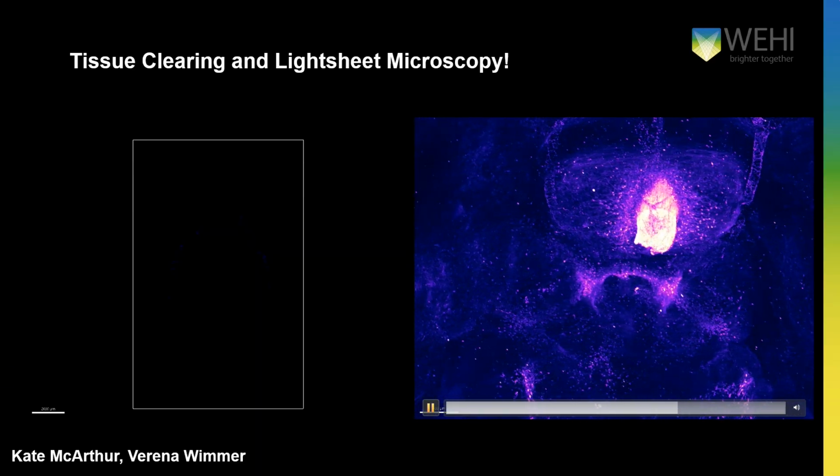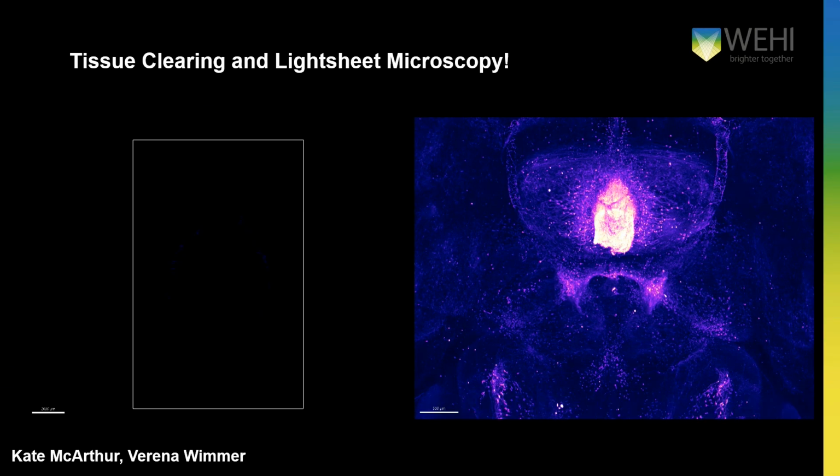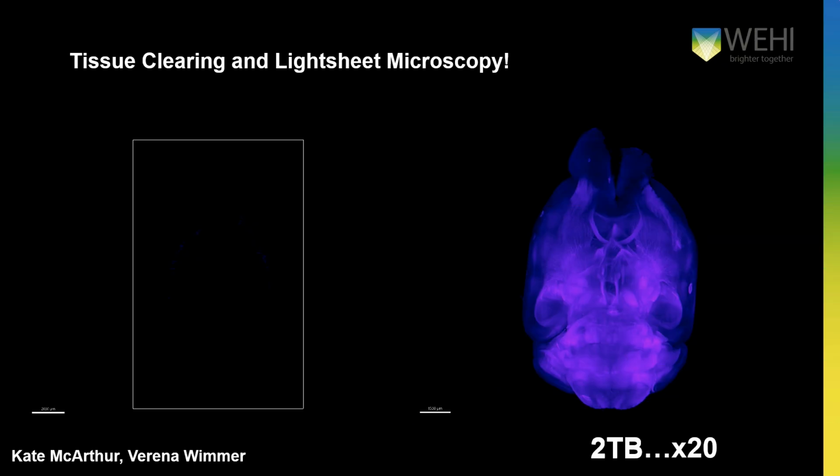And so as I mentioned, the pixel size and the size of the tissue, you can imagine that these data sets are quite big. So each of the data sets is 2 terabytes, roughly. And of course, this is science, so you can't just have one brain. Between the researchers I've been working with, the initial batch had 20 brains, so we had roughly about 40 terabytes of data to analyze. And so, as I mentioned, the autofluorescence channel holds a lot of information about the architecture.